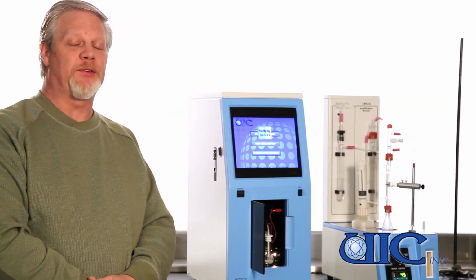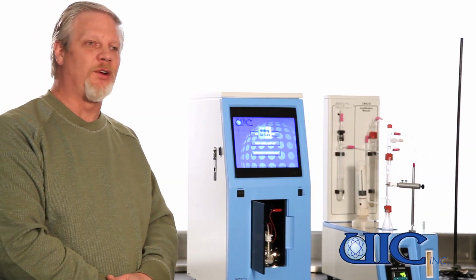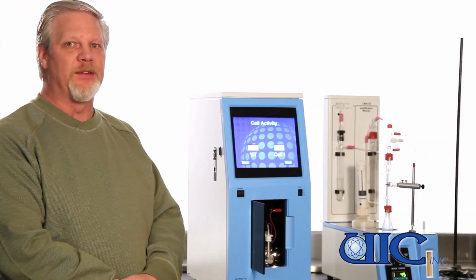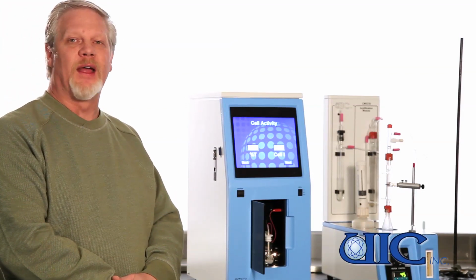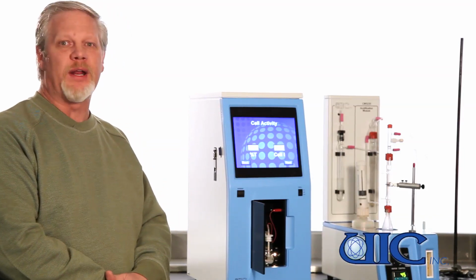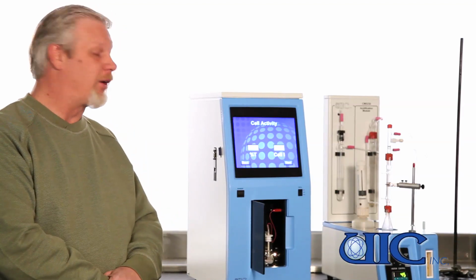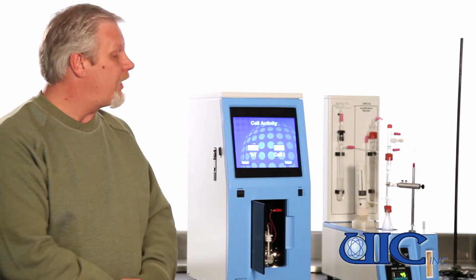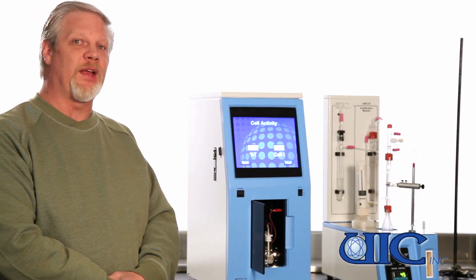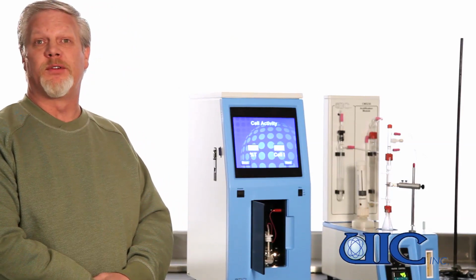You can see when I press Start Analysis, it's verifying that there's an SD card installed in the side of the instrument. The SD card will contain all your data after the analysis, and it is updated and rewritten after each analysis. So no data is lost in case of power outages or any other such occurrences. What we can see now is the cell activity screen.